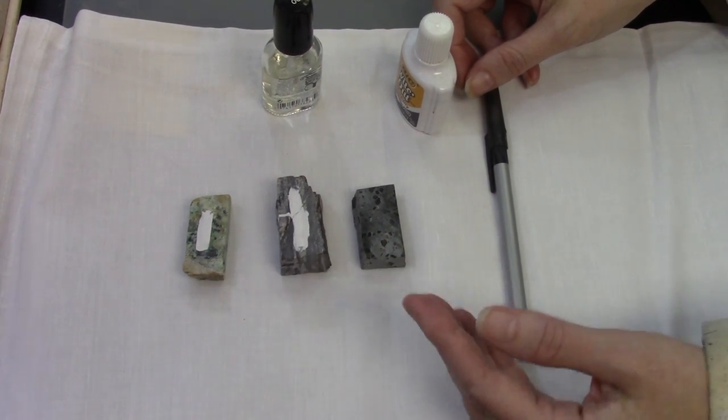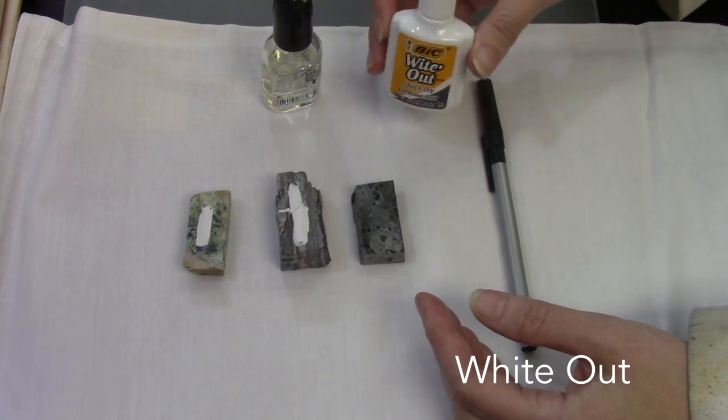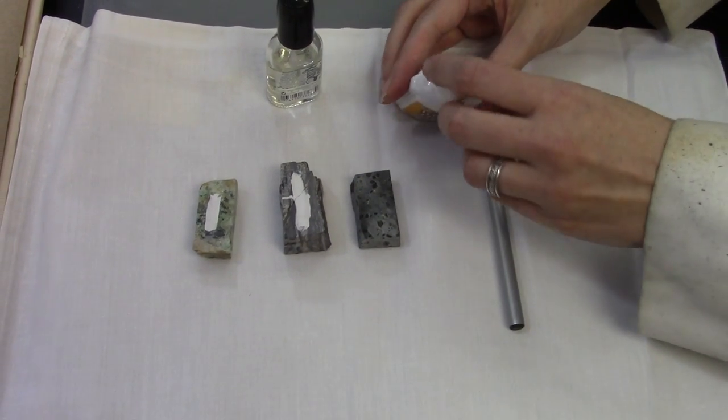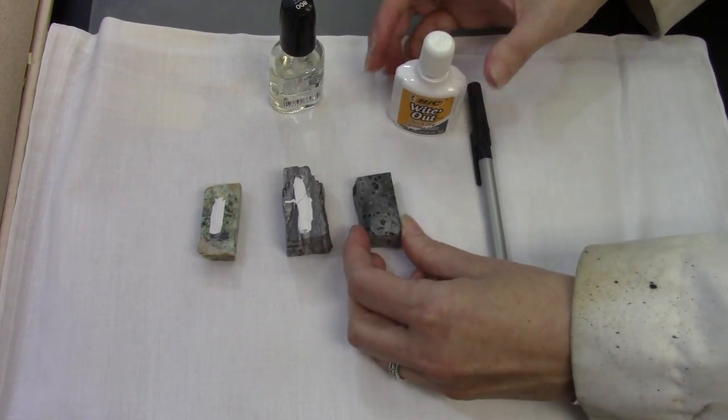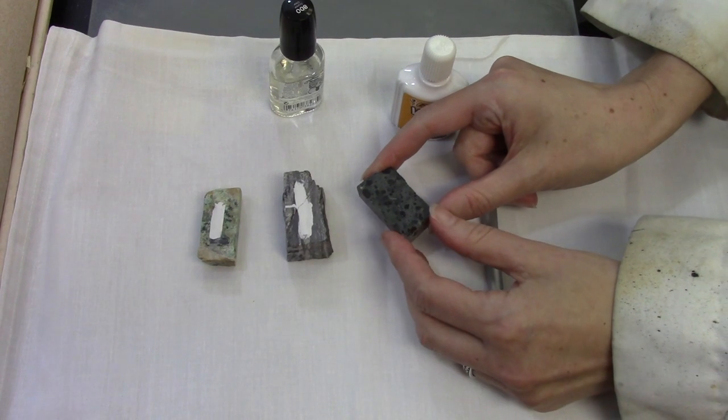One of the easiest ways is to use liquid correction fluid and make a stripe on the side of the thin section that's opposite the side you want to make the thin section of.